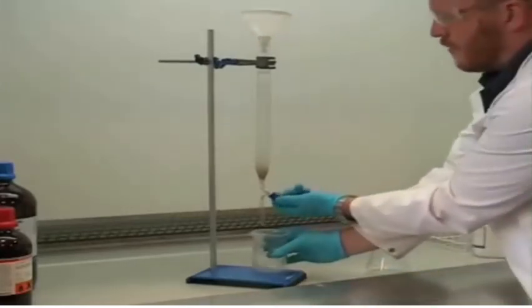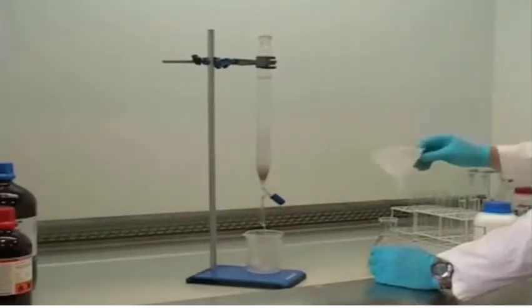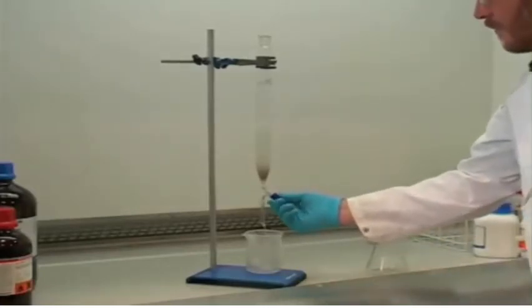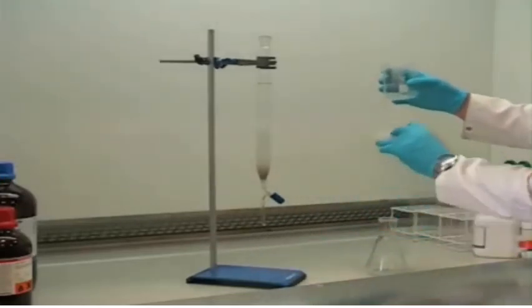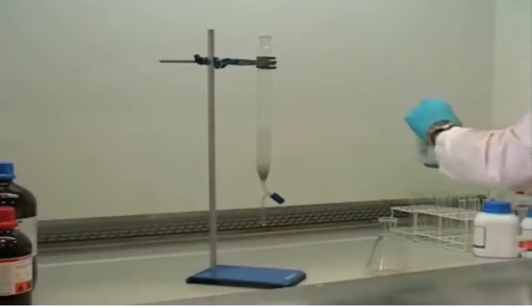Should the level of the eluent get close to the top of the column, then some of it should be removed by opening the tap. We can run this into the beaker, which will then assist us in making a slurry with the remaining silica. And finally, we've transferred all of our silica into the column. Now we need to run some of the eluent out of the column so that it comes down to the level of the silica.